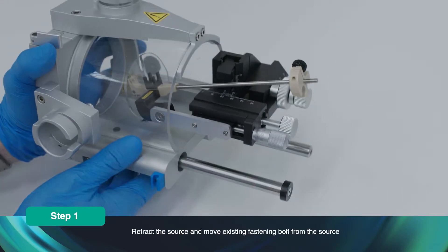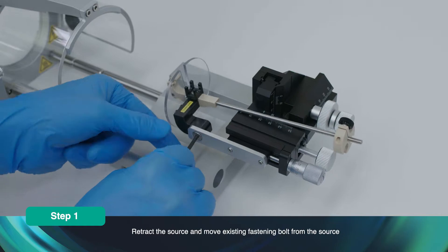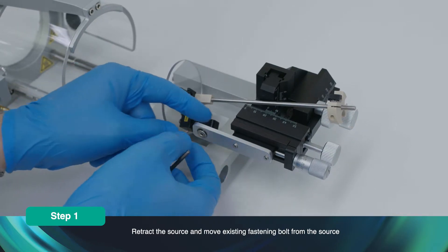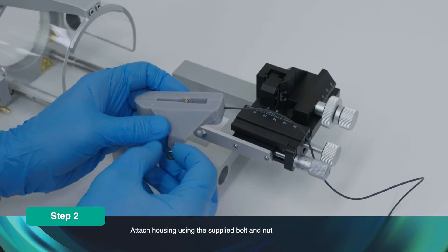Retract the source. Unscrew and remove the existing fastening bolt from the source. Attach the housing using the supplied bolt and nut.